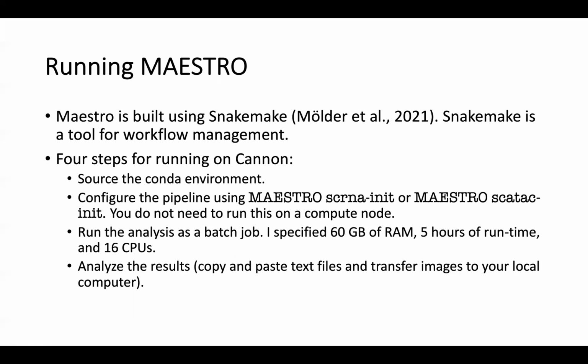Basically it's just going to create a metadata file, a YAML file in the specific folder that says, when it's actually time to run, here's what you're supposed to do. And then once you've done that, you can actually run the pipeline.